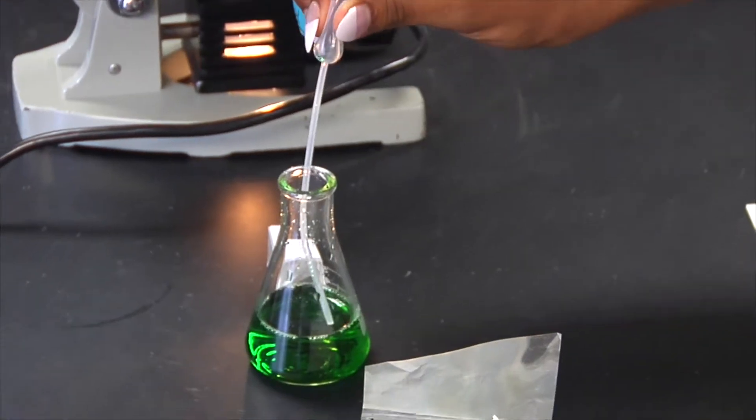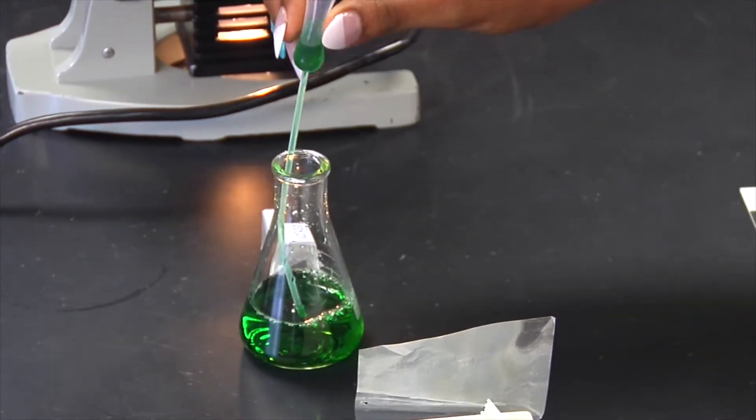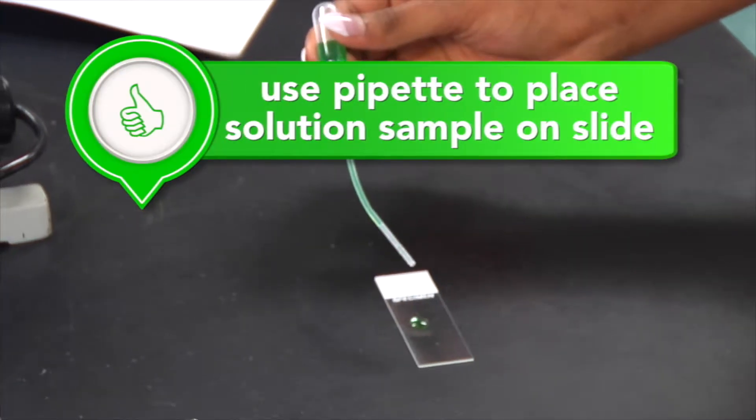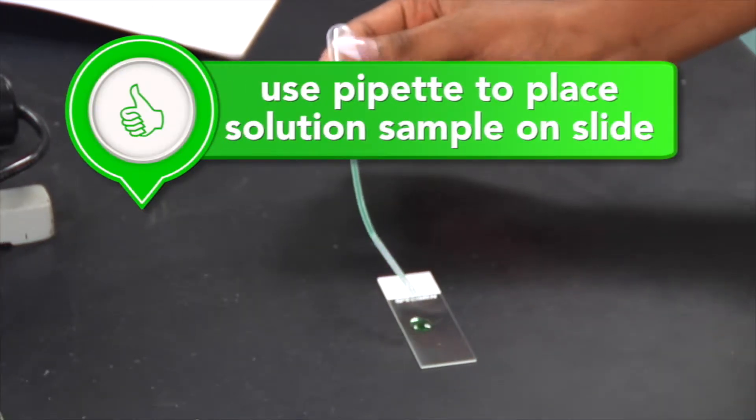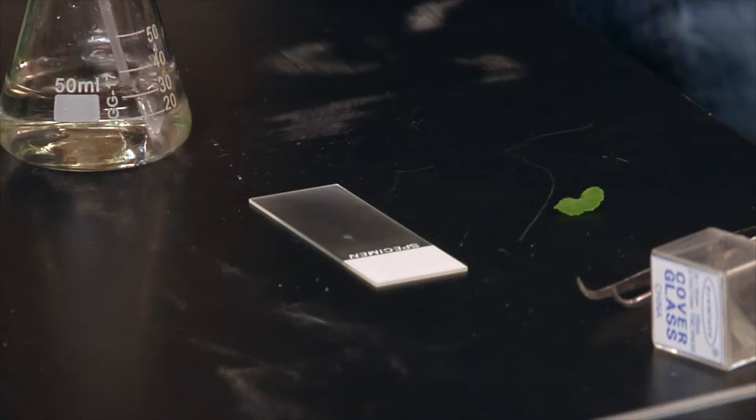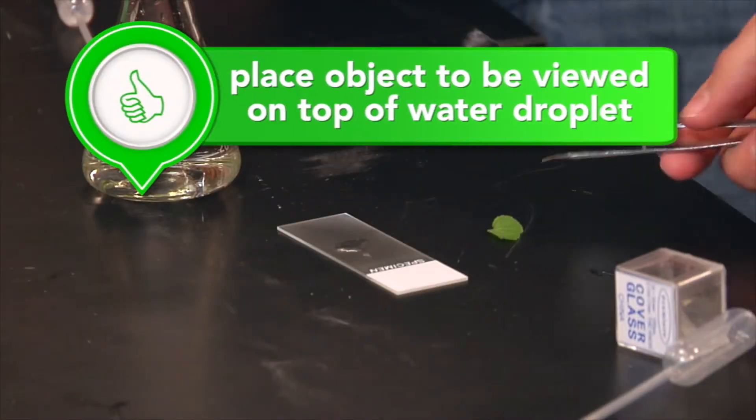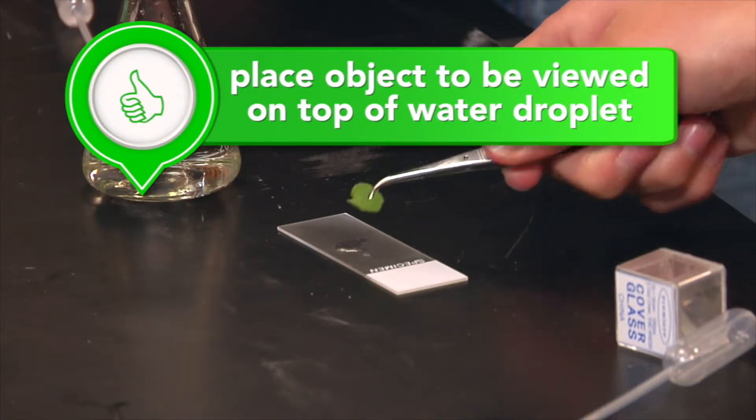Next, you have to prepare the specimen properly. If the specimen is already in water or other solution, use a pipette to place a drop of that solution onto the center of the microscope slide. If the specimen is not in solution, place a drop of water onto the microscope slide. Then place the object to be viewed on top of the droplet.